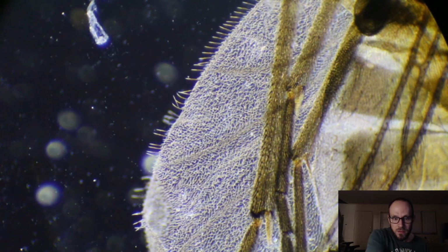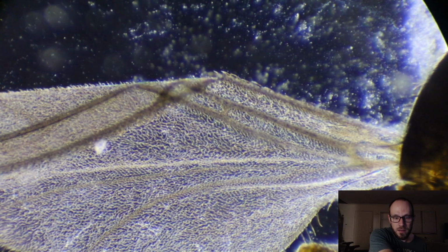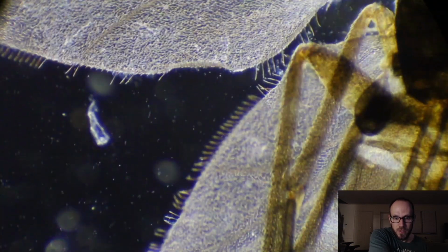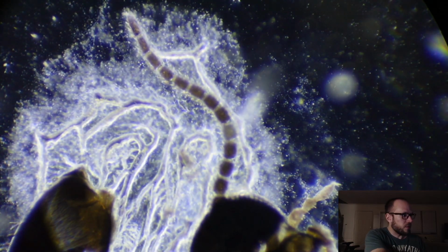I mean, I used some pretty competent microscopes in school. This one beats all of them, and this is the first microscope with which I've been able to mess with Darkfield. But anyway, let's switch from something dead to something that will hopefully be alive.